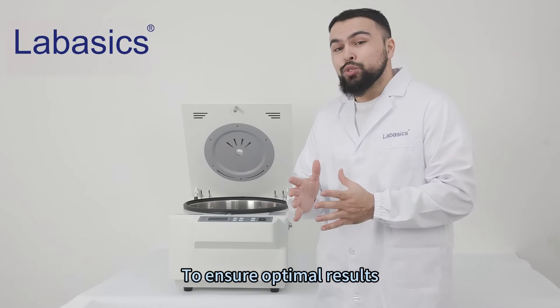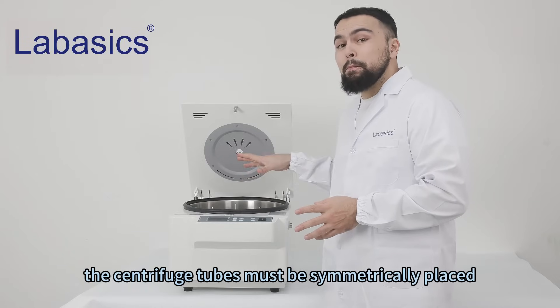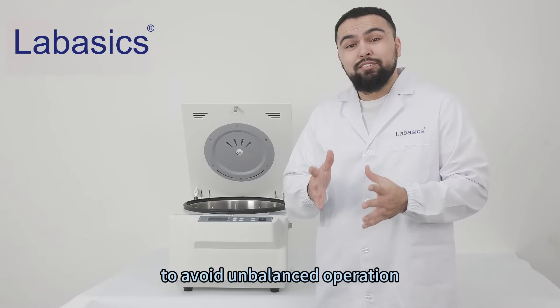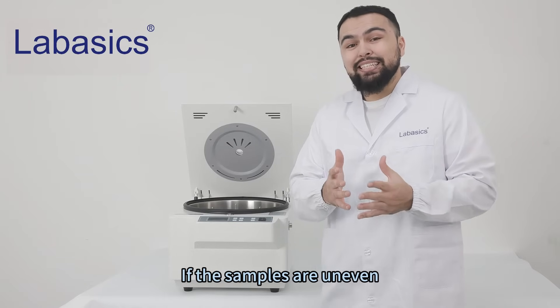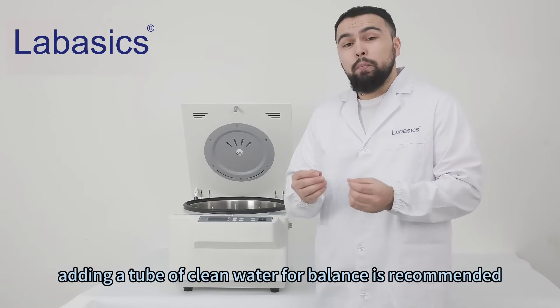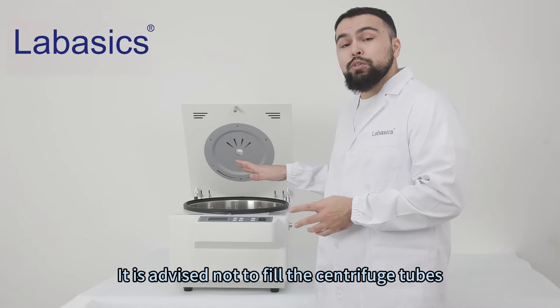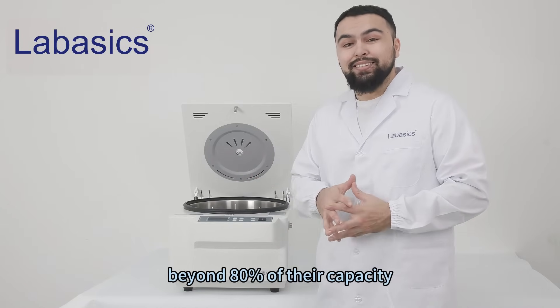To ensure optimal results, the centrifuge tubes must be symmetrically placed to avoid unbalanced operations. If the samples are uneven, adding a tube of clean water for balance is recommended. It is advised not to fill the centrifuge tubes beyond 80% of their capacity.